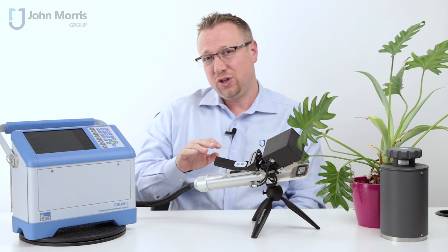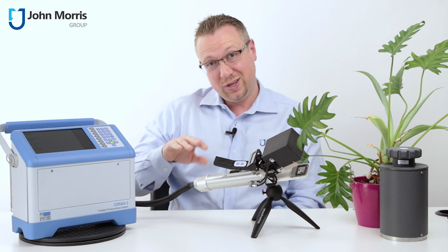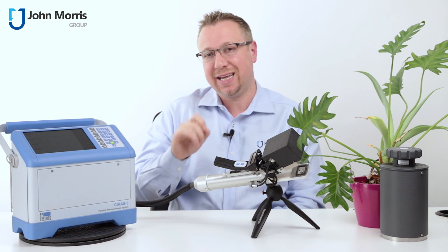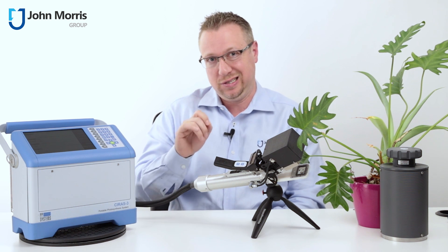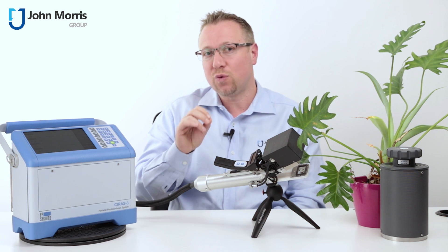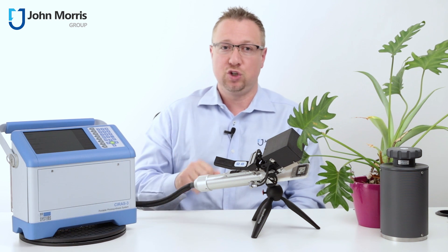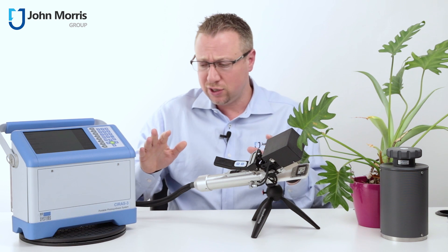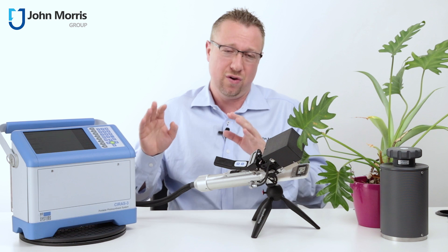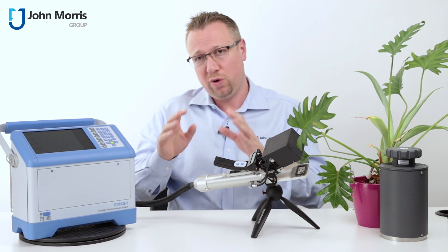If you're a plant physiologist, you're probably already using a piece of equipment like this, but for the rest of us, what actually is it? Well, this is a true differential gas analyzer for measuring photosynthesis — to quantify the mechanics of photosynthesis such as the rates of CO2 absorption, or looking at the electron transport chain. It's all based off infrared gas analyzer technology, also called an IRGA, and what that infrared technology does is it looks at CO2 and H2O vapors.